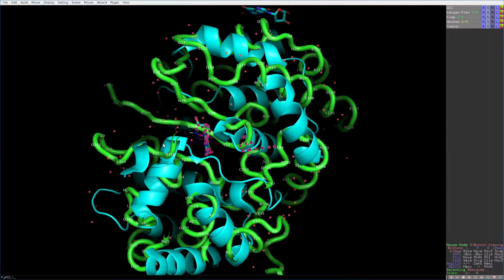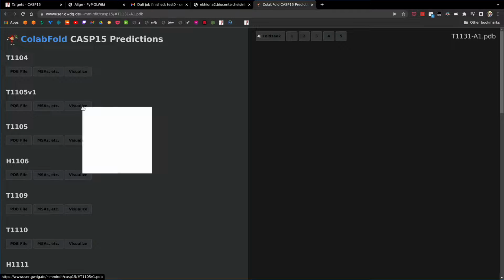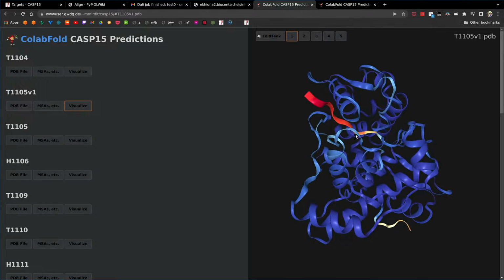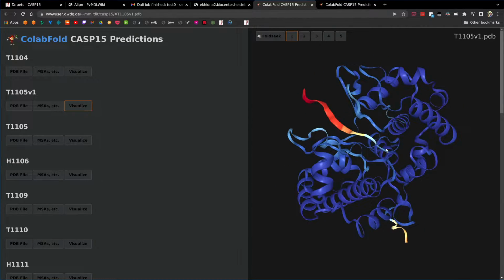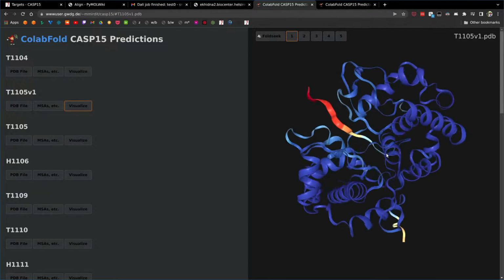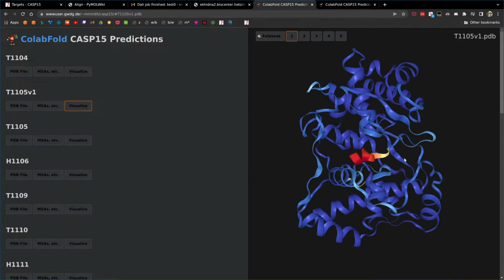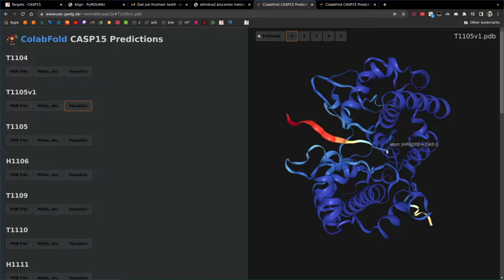What if we look at the ColabFold? This one. I see like all of that. See, maybe I should have just cut all that off, because that's really just going right in the active site there, right after that tyrosine arginine.